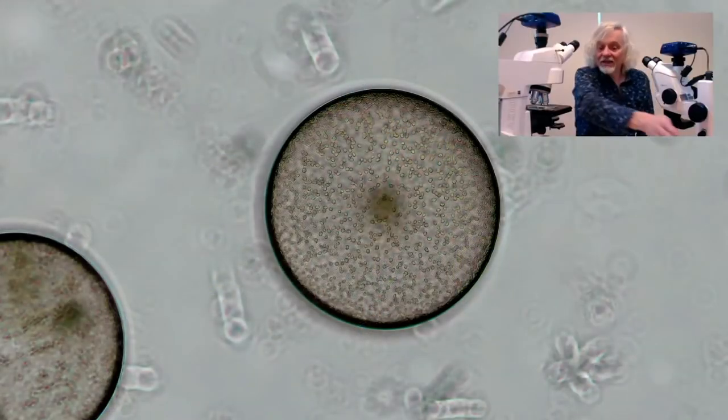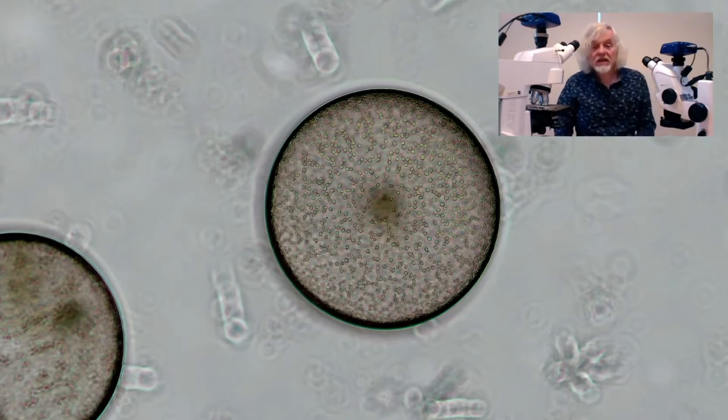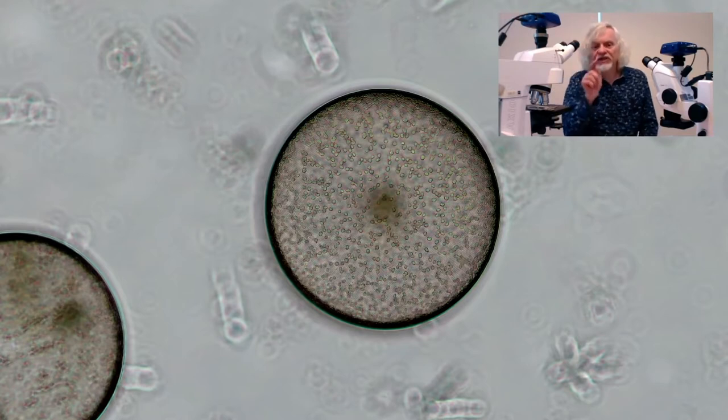Here we go. That is a single Coscinodiscus seen much closer. You can see it's got all these little dotties on it.